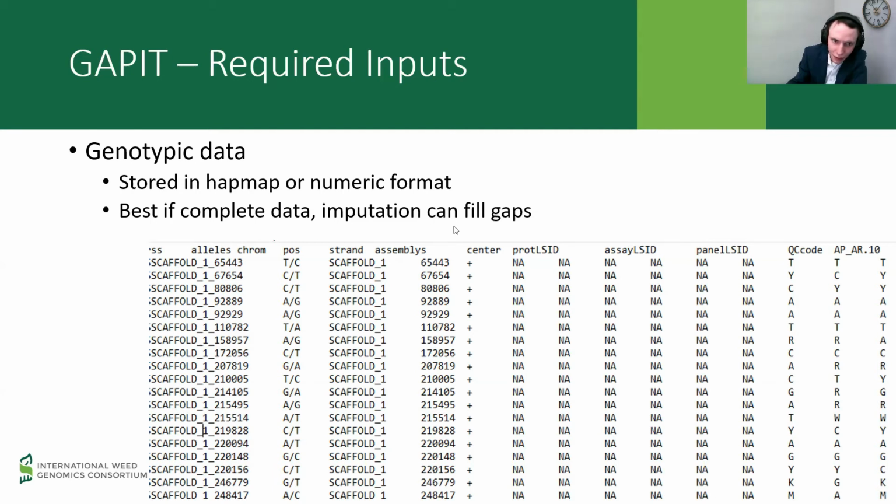There you can impute missing genotypes. Genotyping technology isn't perfect. You're going to have regions of a specific sample at a specific marker where the information just didn't get sequenced for whatever reason. You can use an imputation strategy, where the better ones will take individuals highly related to the missing information, and based off that, make their best guess for what genotype should be put in.